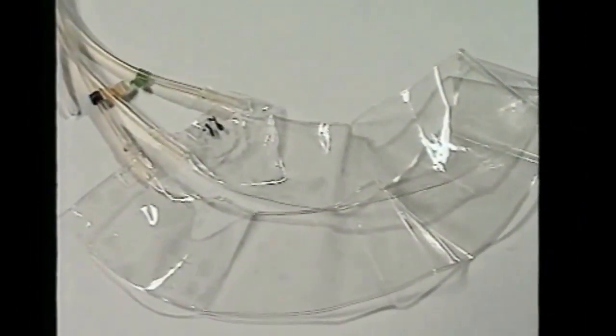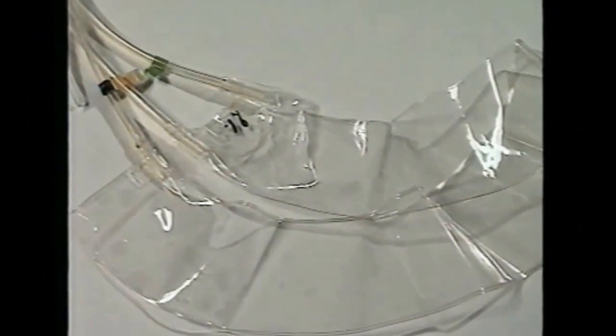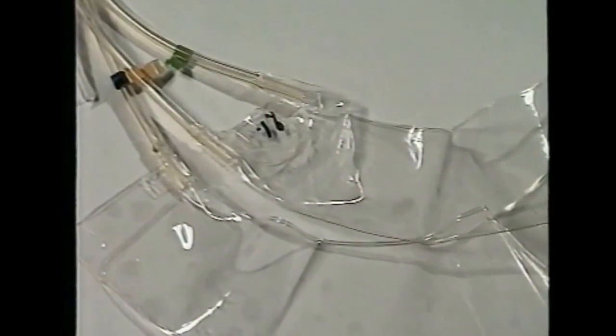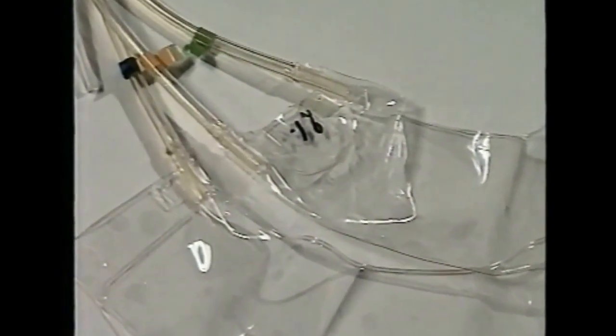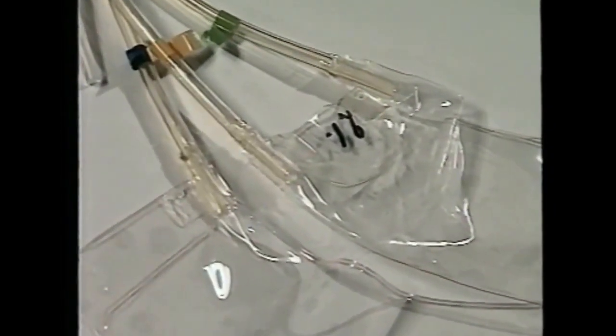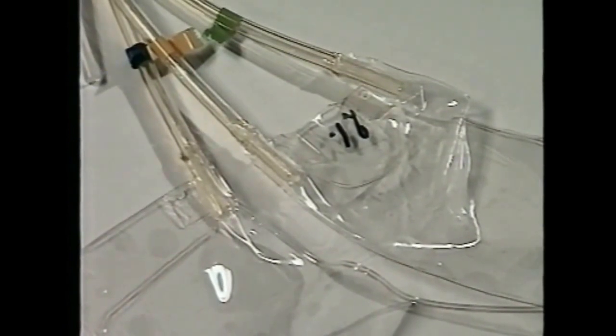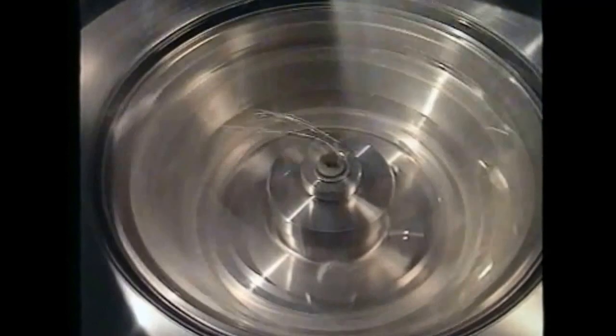To produce a completely sealed system, the Centritech cell uses a bladder with feed and return tubes welded into it to form a completely closed system. The bladder is fitted inside the bowl of the centrifugal separator.